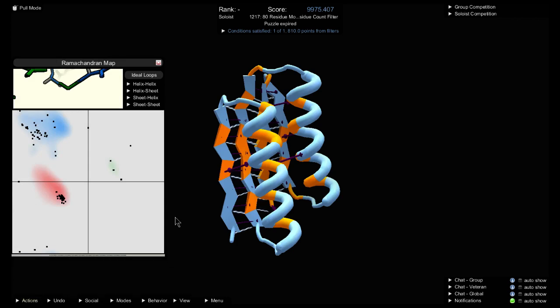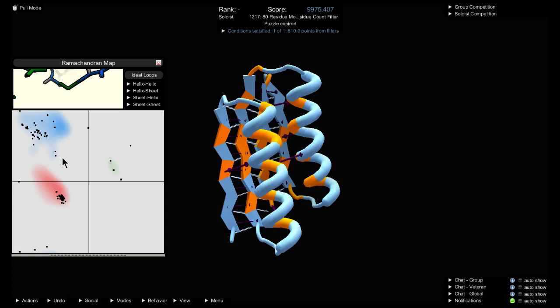The Rama map is mostly white, but it has some colored areas, and each amino acid in the protein has a dot on the graph. What you want is for all the dots to be in the colored areas.